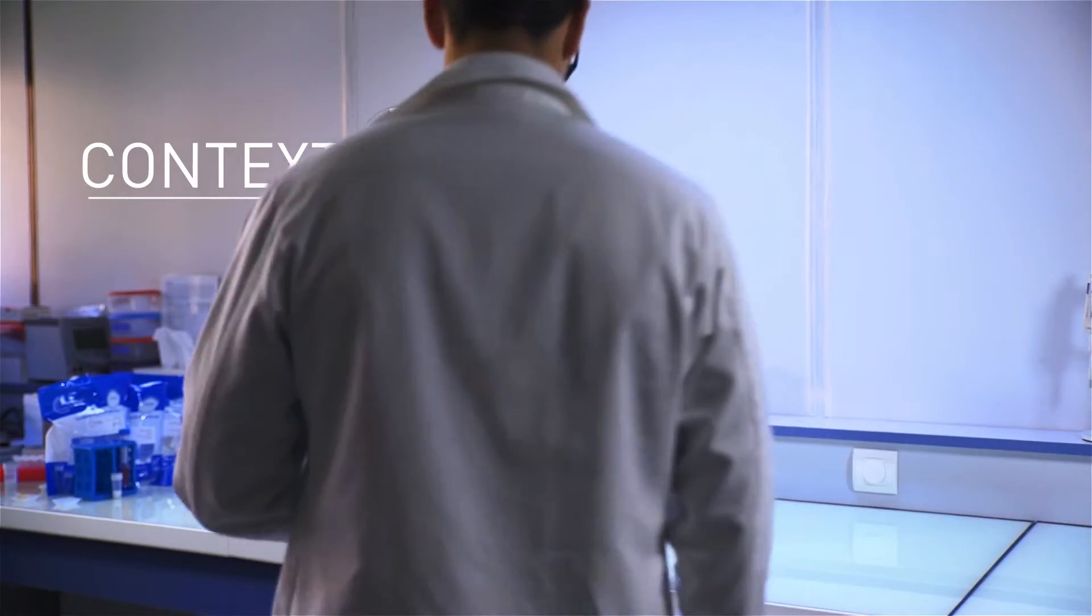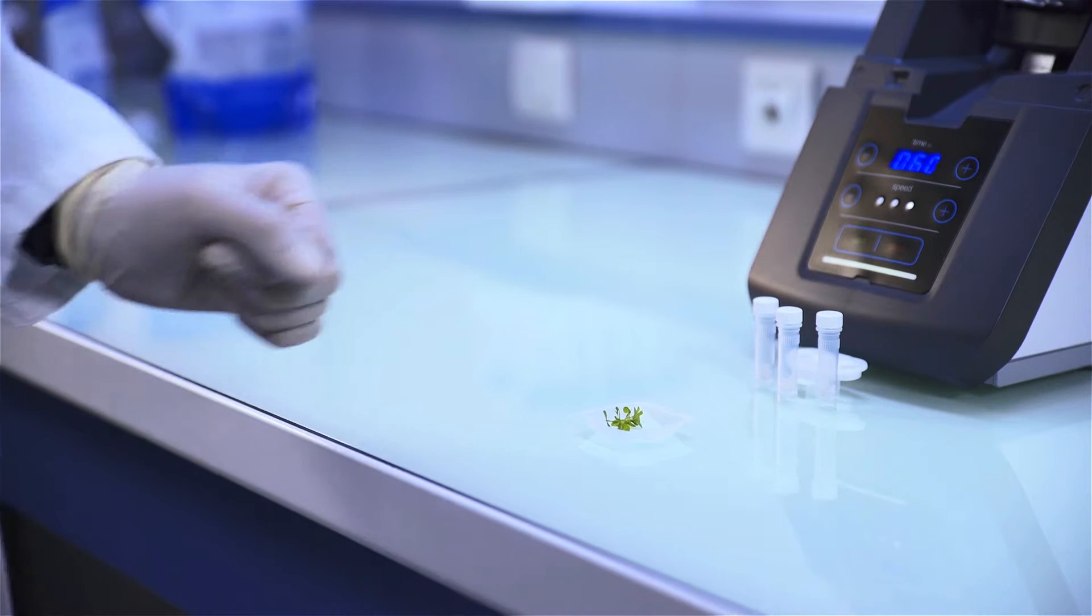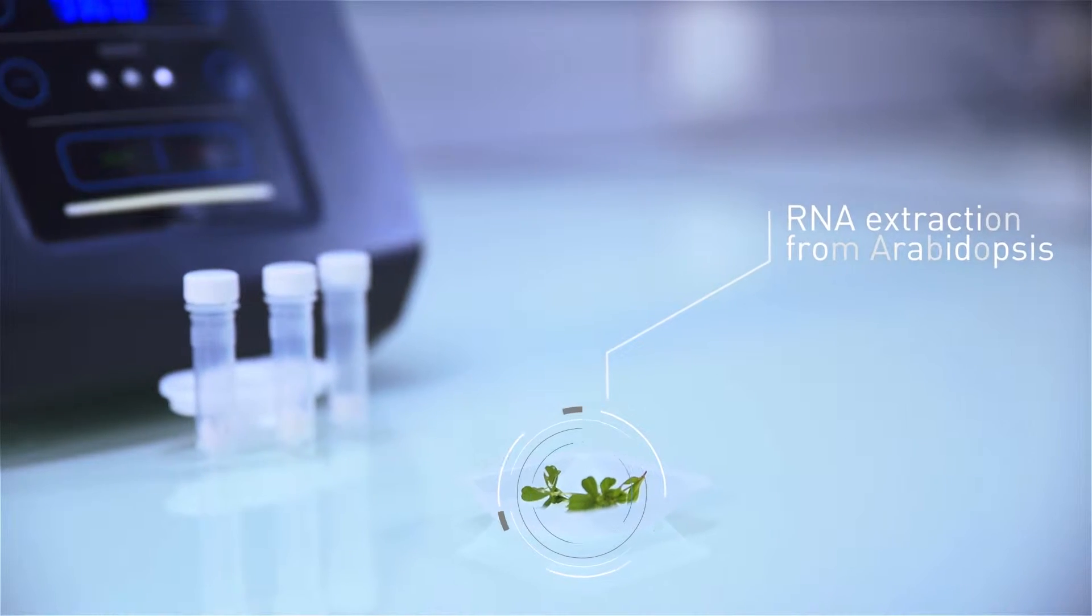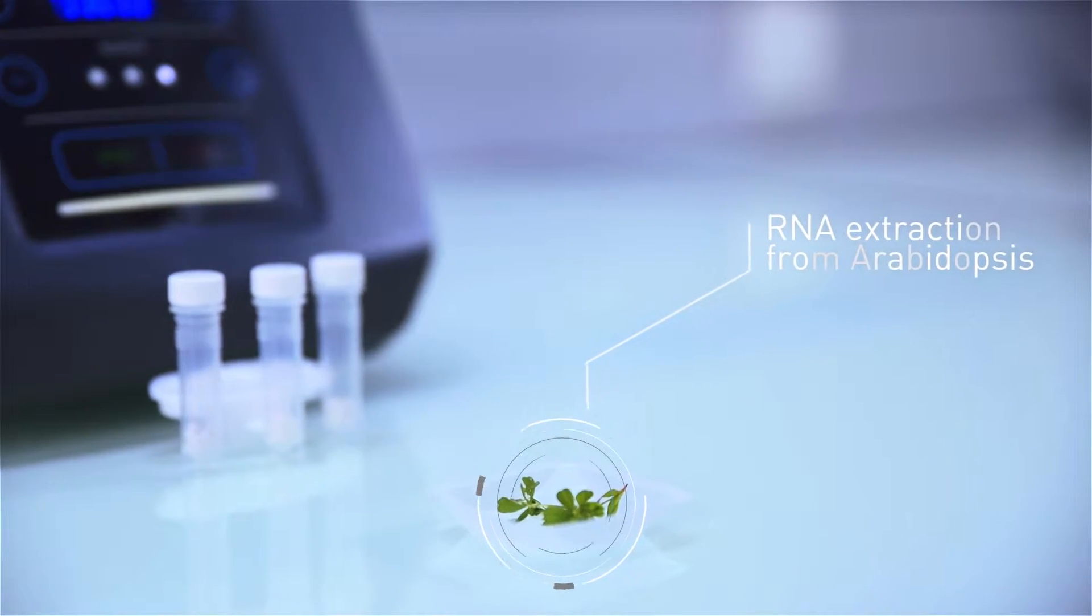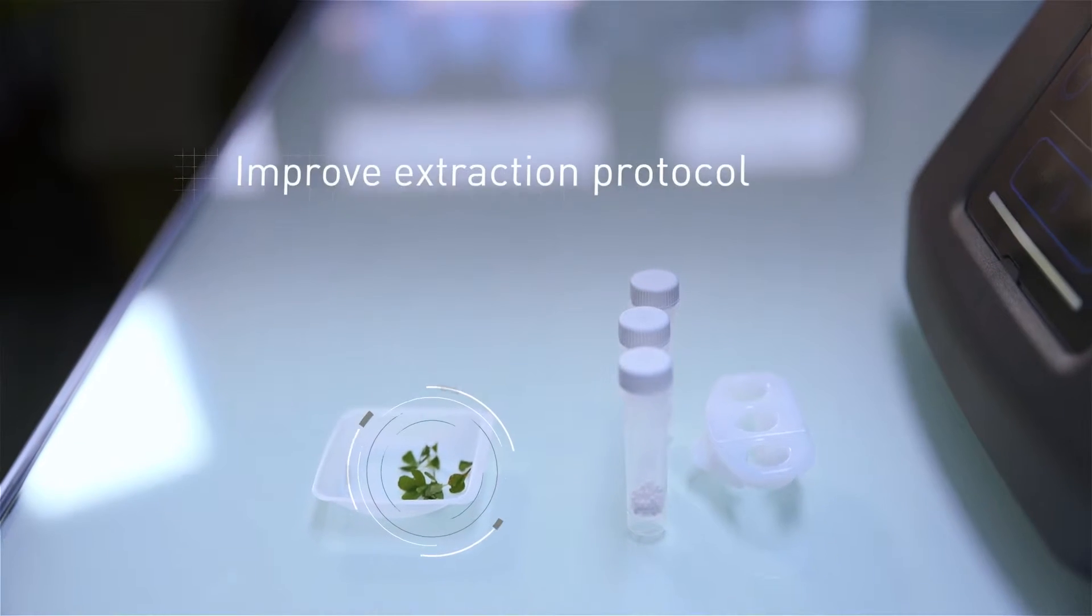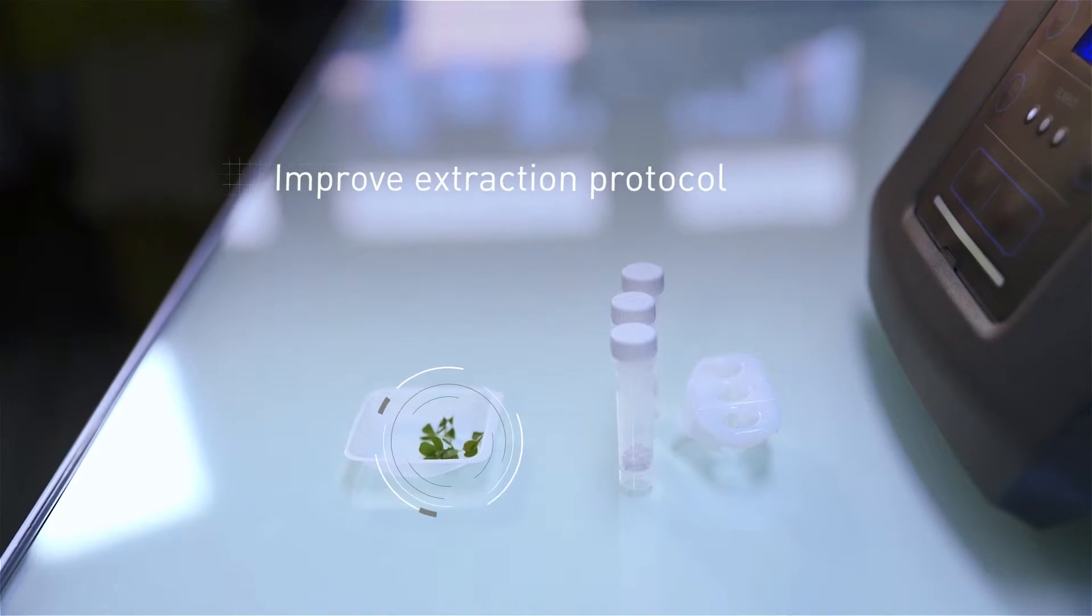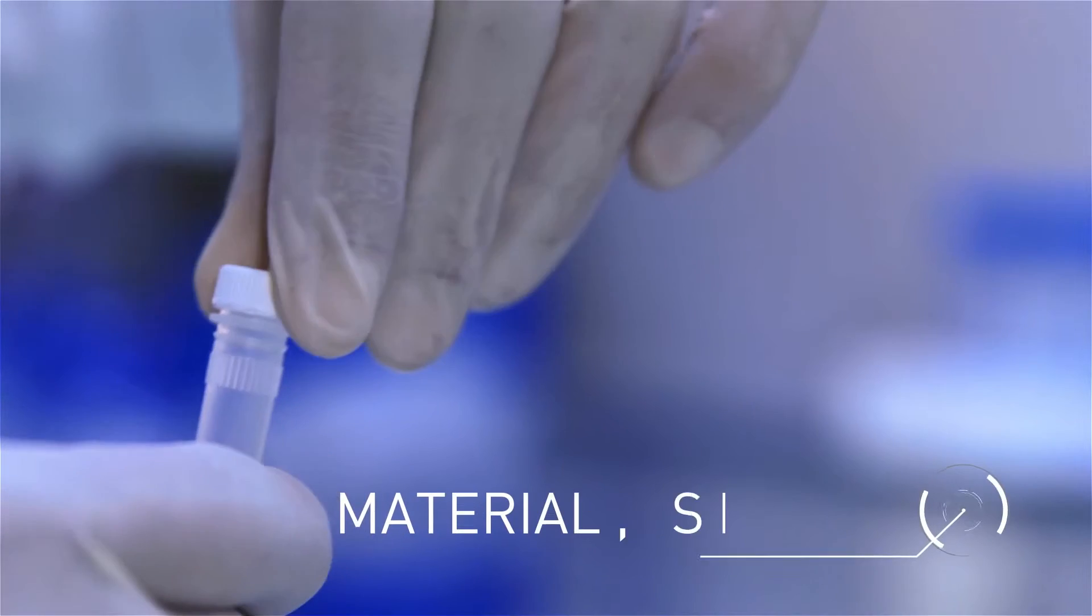Using Arabidopsis seedlings as a model, the aim is to extract high quality and quantity of RNA for further analysis using the mini list as an alternative to the current manual method of grinding with mortar and pestle.